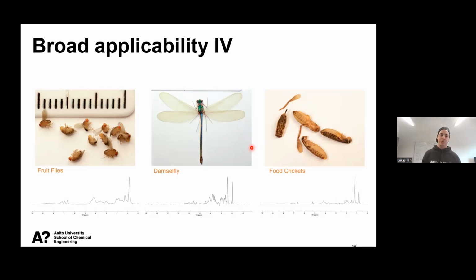Also other materials I want to show, for example, proteins that you can find in foods, or possible food from the future. And it's also not optimized for this. However, it just should show the broad applicability, and it will also not reach the same level as protein NMR we know from biochemistry applications. But for example, in composite materials, that could be interesting, or also in fingerprinting applications.